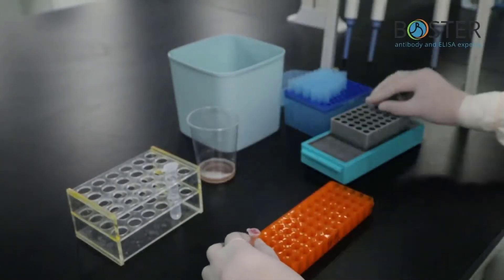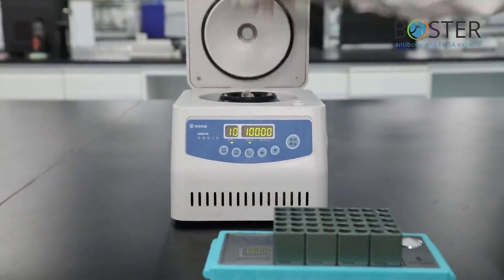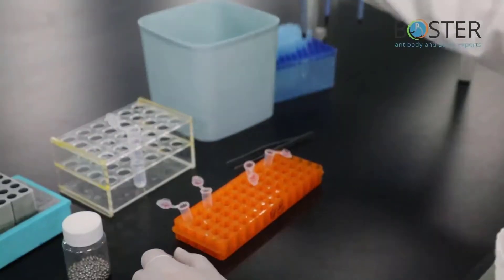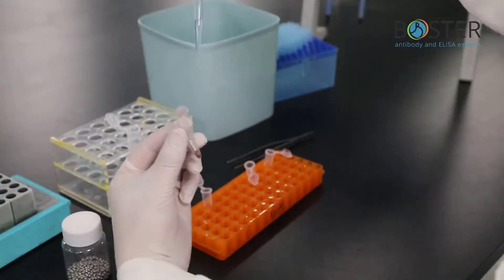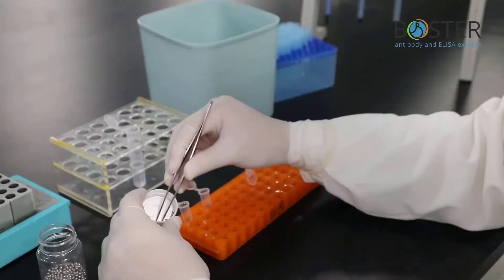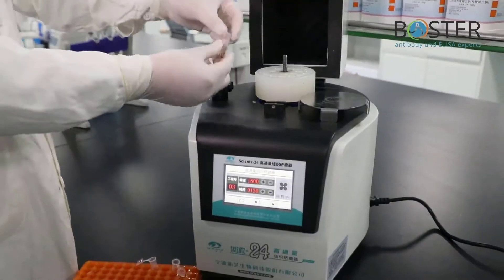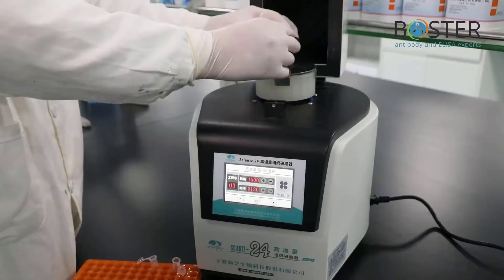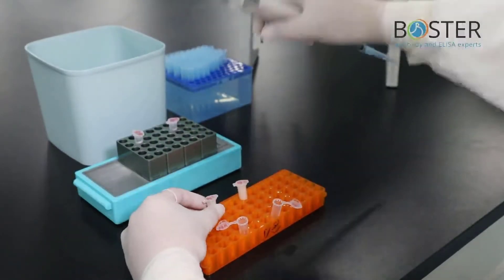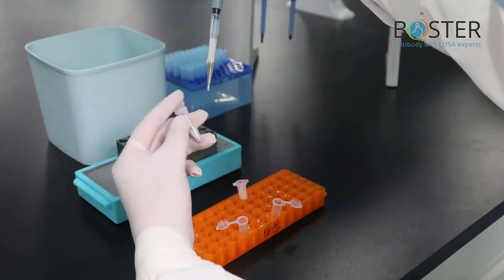For tissue: take an appropriate amount of tissue and weigh it. Add RIPA lysis buffer containing enzyme inhibitors at a rate of 1 mL of lysis buffer per 0.1 gram of tissue. Grind well. Transfer the homogenate to a centrifuge tube and lyse on ice for 30 to 60 minutes. Sonicate, then centrifuge at 10,000 RPM for 10 minutes. Take the supernatant.